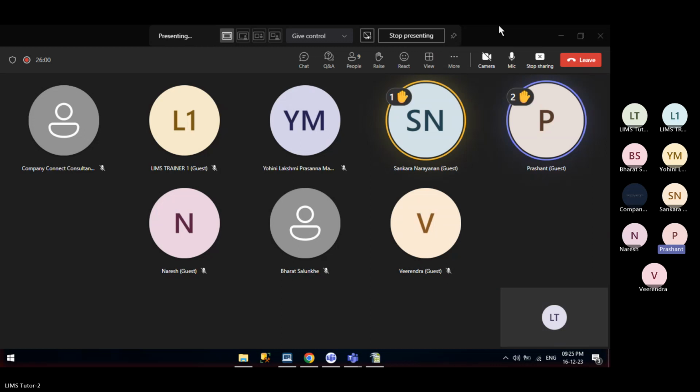My question is about the data sheets, analysis data sheets, how that will be configured with the product level in LabWare. Yes, that will be covered in master data.